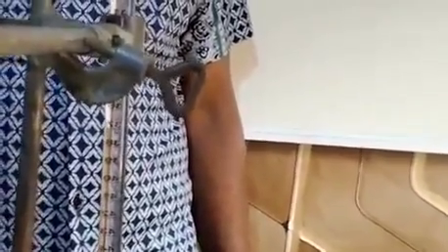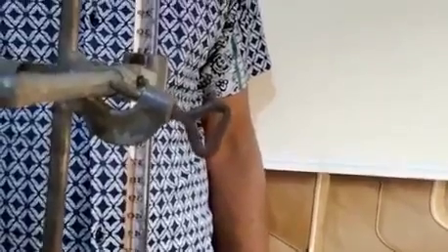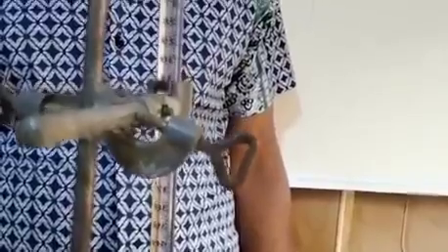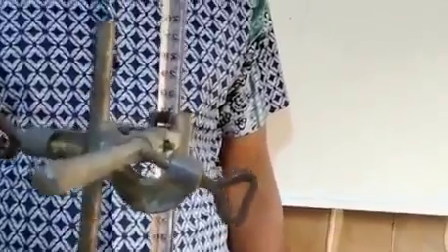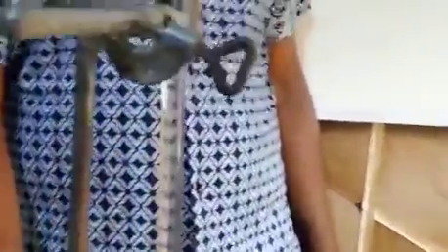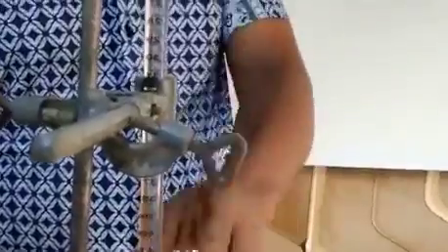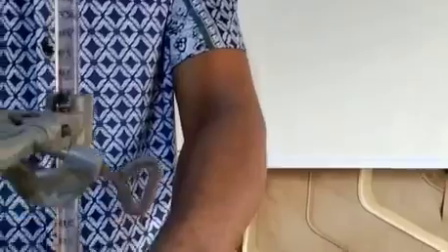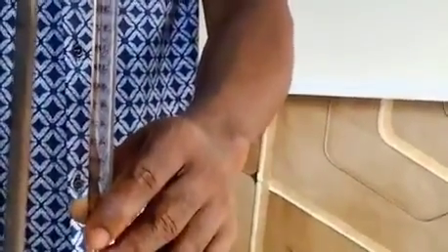So we're moving around 18 now. It's going around 18.5 now. Then around 19.5, going to 20. Then we have 20. We're coming close to 21. So at 21, I'll pause the buret. I've done that, and I like to go drop by drop later.